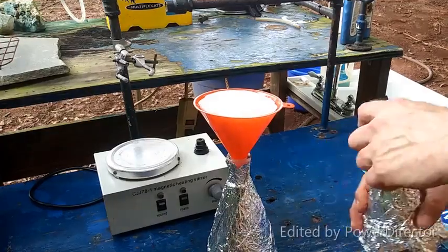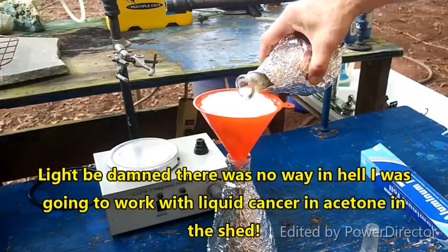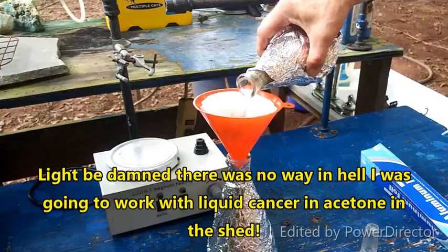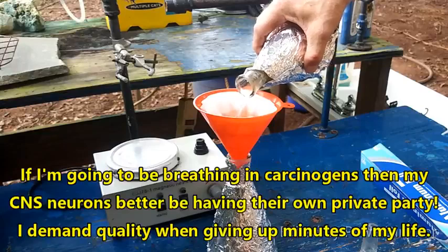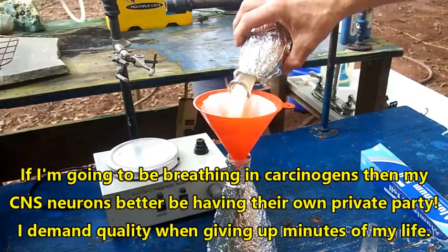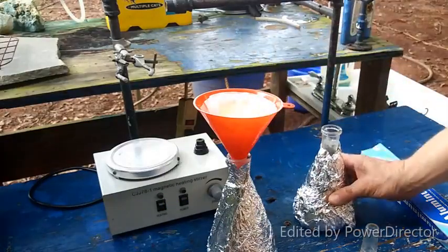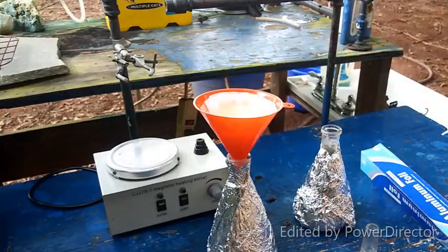I am going to go ahead and filter it. And when I am done with that, we are going to distill off the acetone. Anyway, I will come back when I'm ready to do that.